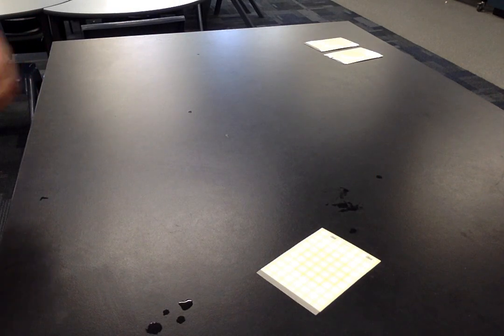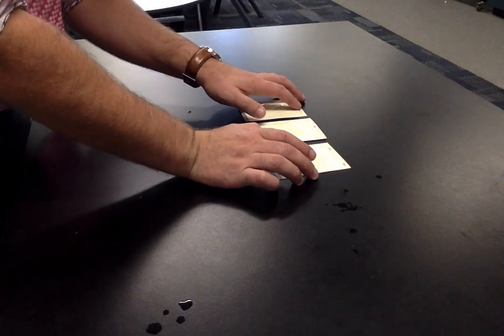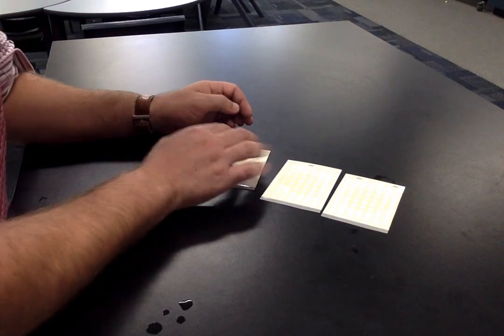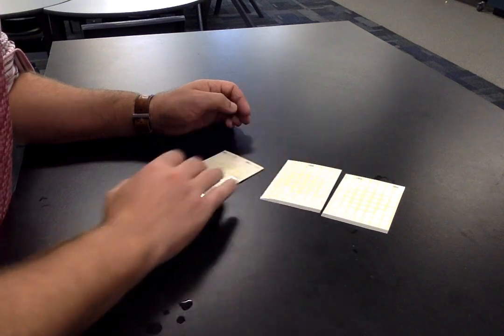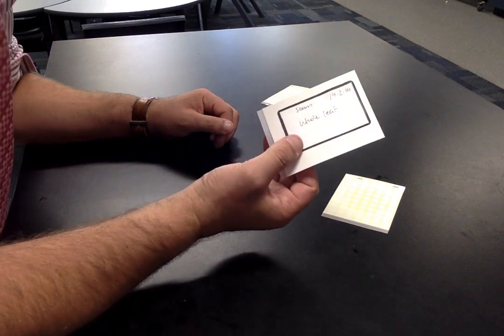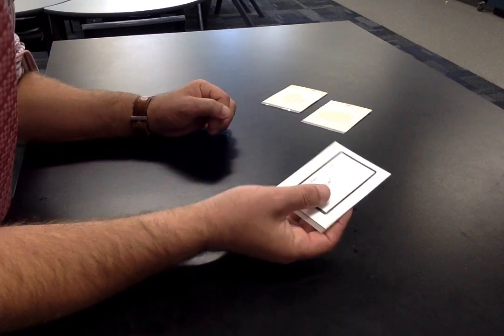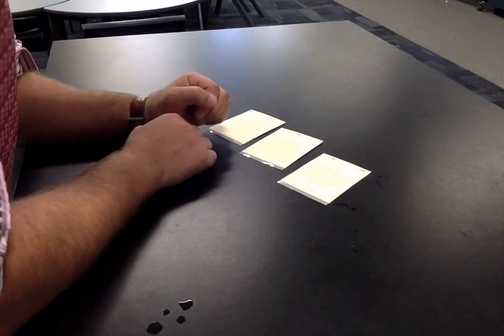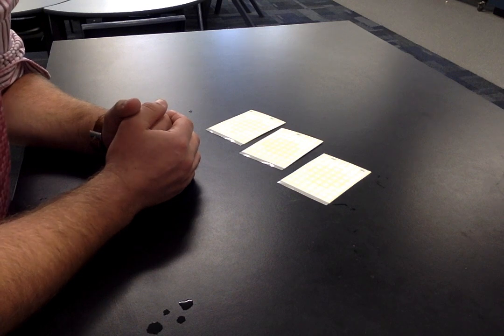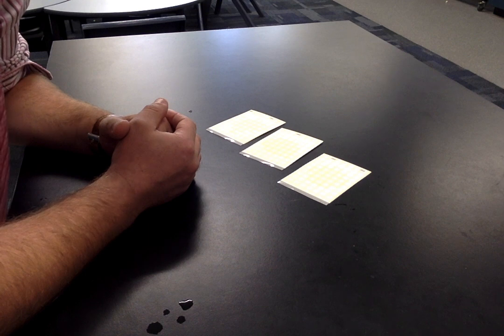Place all three petrifilms into a clean ziplock bag for incubation at 35 degrees Celsius. Results should be available in approximately two days. To recap: we've got three petrifilms — the first is our experimental control, which will go into the incubator along with our whole salad leaf sample and our pre-cut salad leaf sample. We'll be able to count the colonies that grow and make an assessment as to which is cleaner or dirtier. Thank you very much.